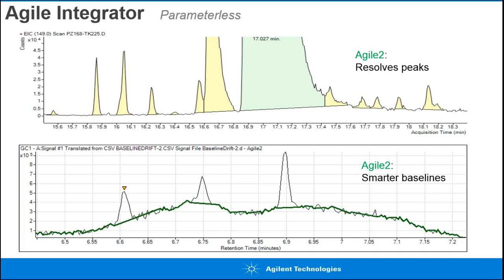All right, last, somebody might say, well, listen, I'd really like the integrator to take care of integration for me. So we have a number of integrator approaches. We put a lot of effort into a parameterless integrator. So let me show you a couple advantages of those.